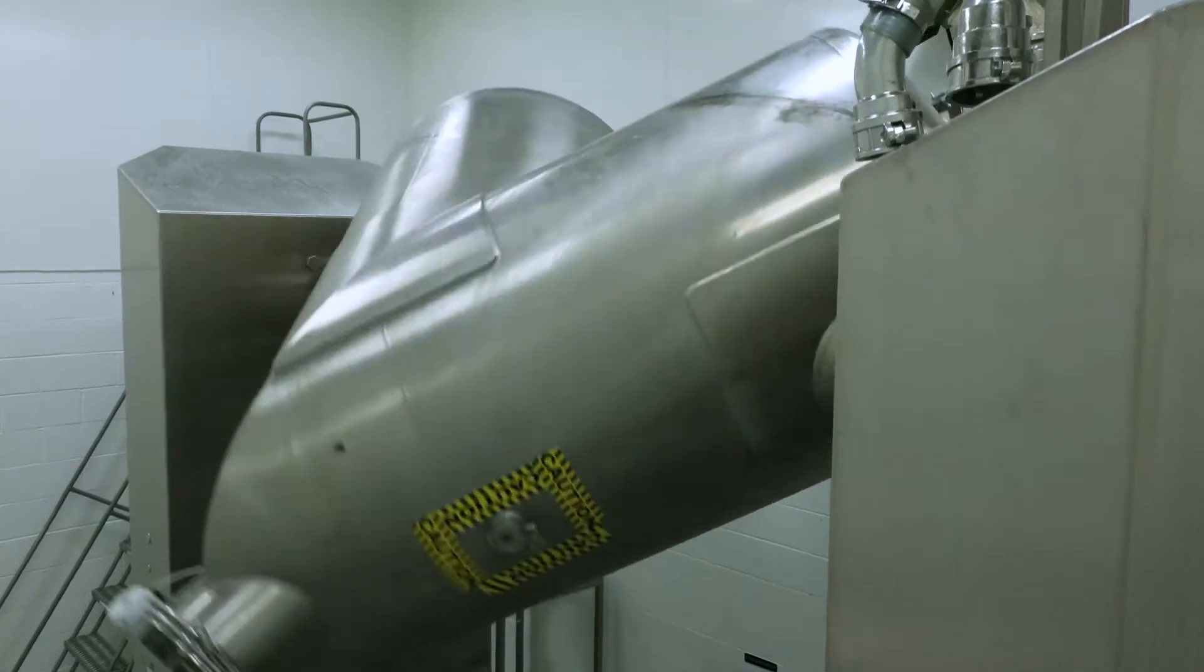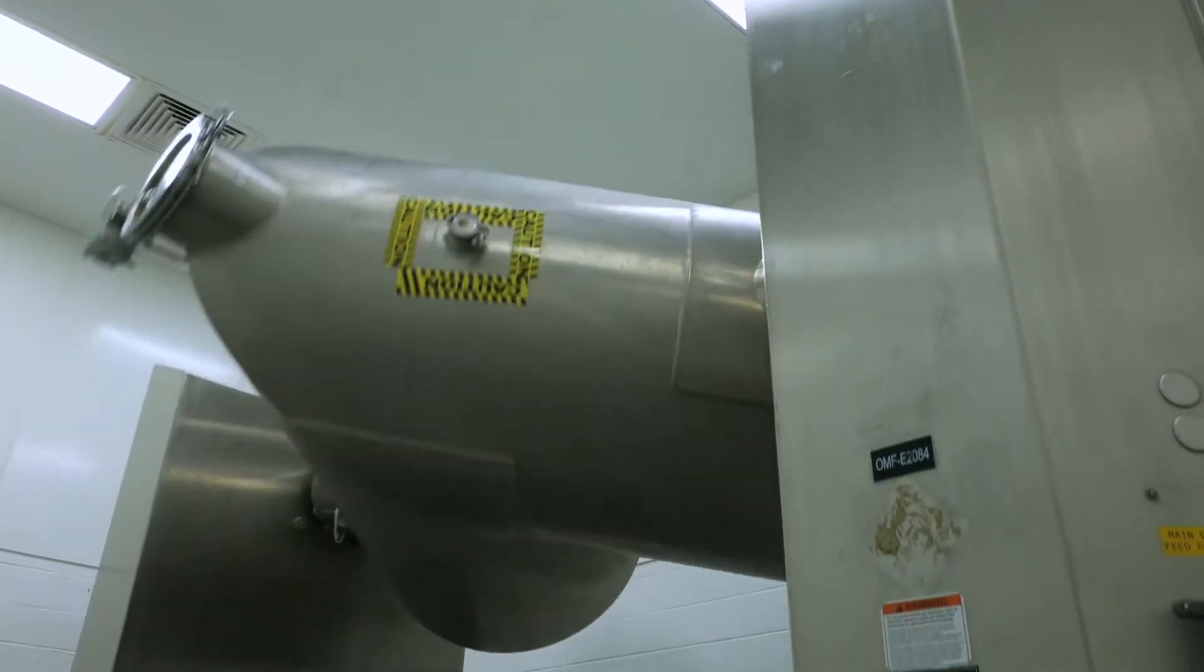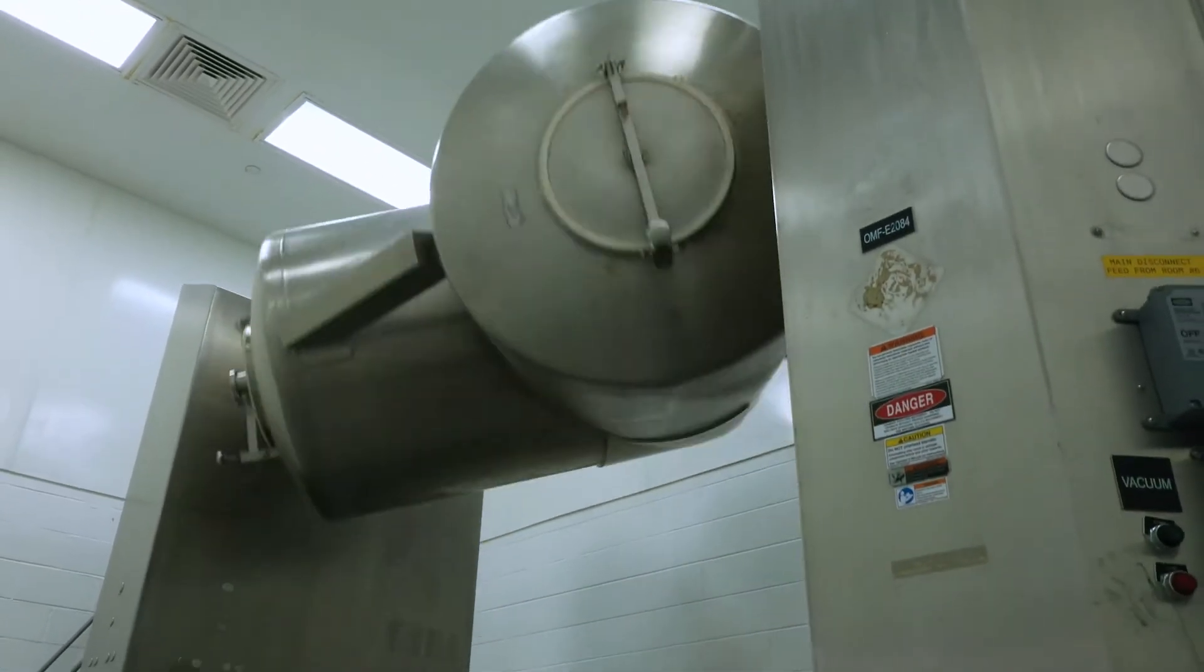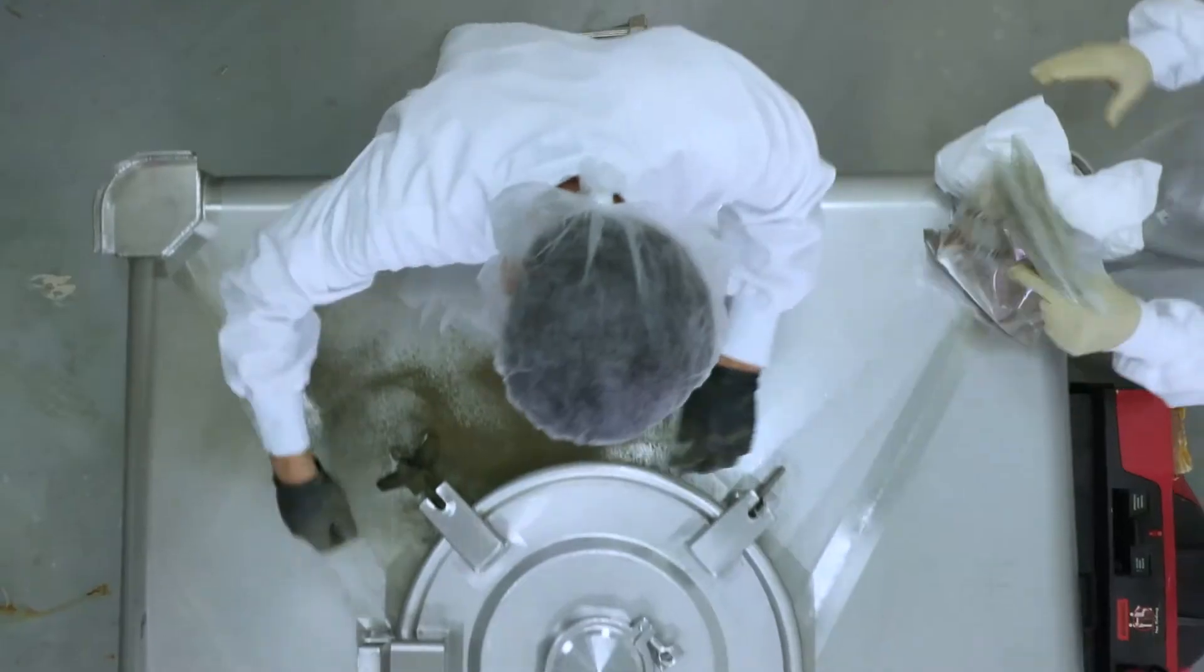Once they have been added to the blender, the Stemregen ingredients are then thoroughly mixed for several hours to ensure a perfectly homogeneous blend.